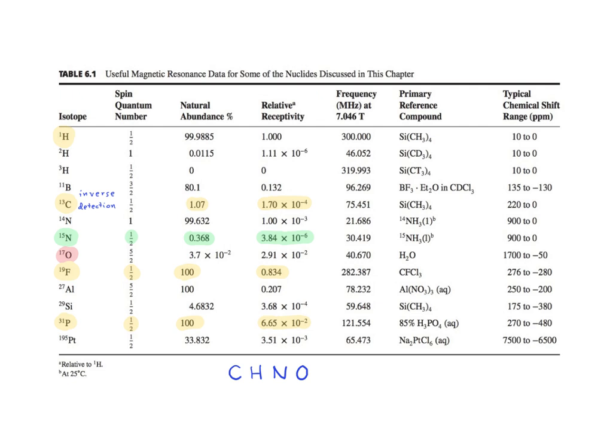However, phosphorus is very important in biomolecules, linking the nucleosides of DNA and RNA, also phosphorylation of proteins, and there are a number of small molecule drugs and chemical reagents that have phosphorus in those structures. The textbook has a section on silicon-29 NMR spectroscopy, but I will skip that section in favor of the other nuclei that I've just mentioned.